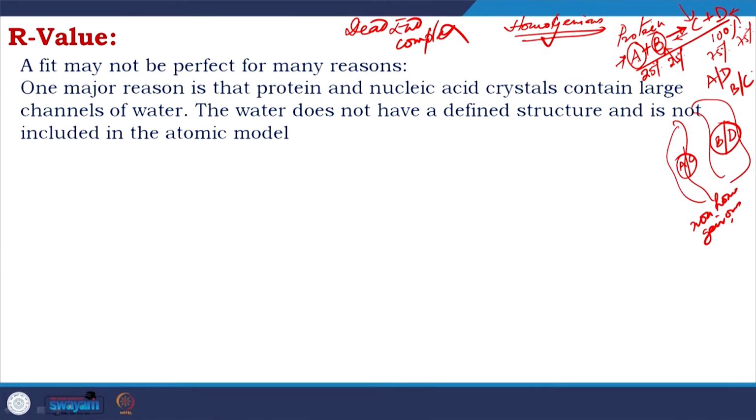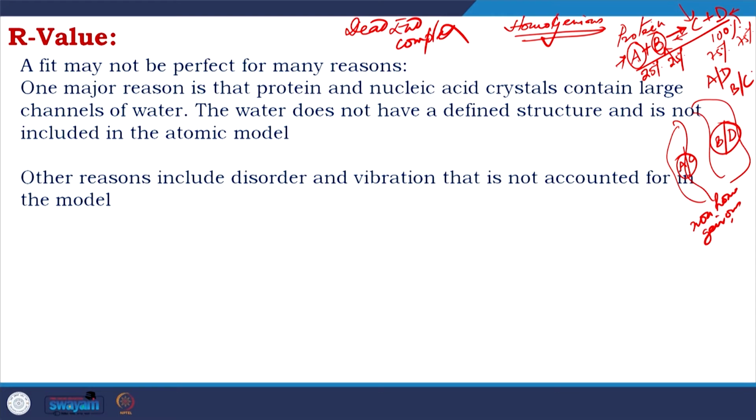So, that is a major reason, that the protein and nucleic acid crystals contain large channels of water. The water does not have a defined structure and is not included in the atomic model. Other reasons include disorder and vibration that is not accounted for in the model.